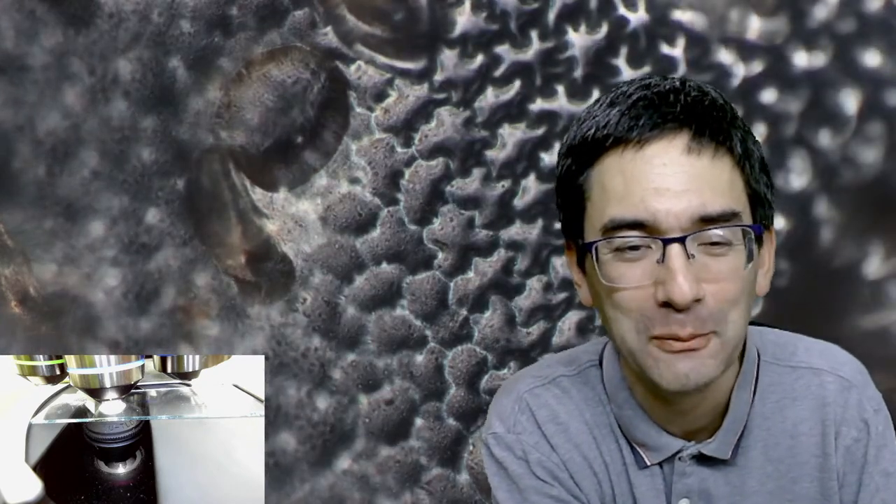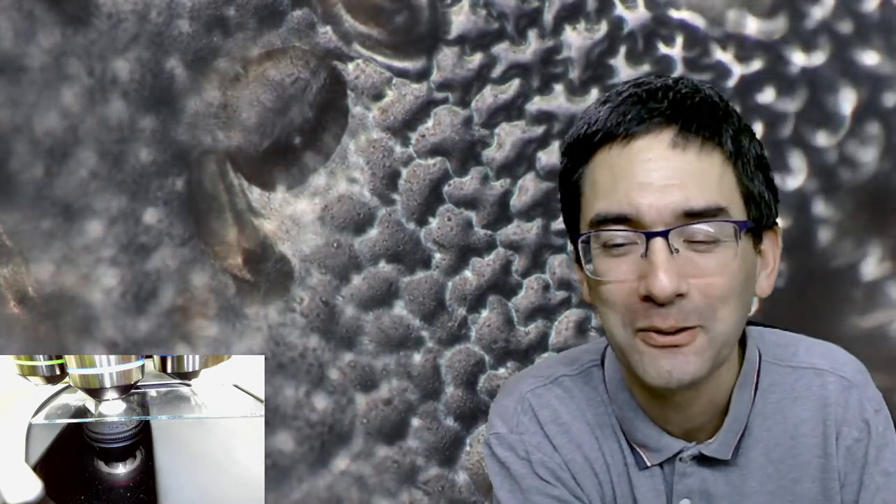I like this one a bit more because you see the actual shape of the cells - how they are fitting together almost like puzzle pieces. Let's go up to 40 times. This is the tomato leaf from the top. I just happened to have tomato plants on my balcony.